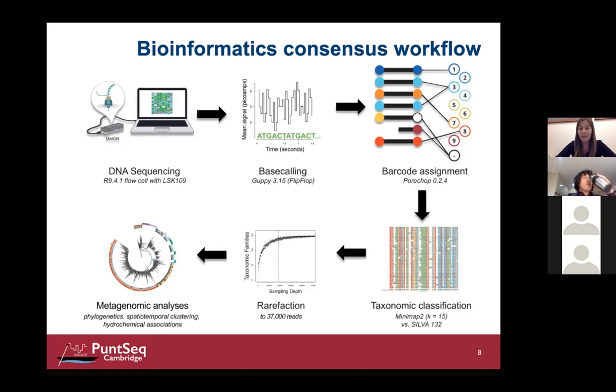We used what at that time was definitely the best base caller out there, Guppy, with the flip-flop option that is even improving the read calling quality at locations where you have a lot of similar consecutive bases. And I do think Guppy is still amongst the most widely used base callers right now. It definitely was at that time.